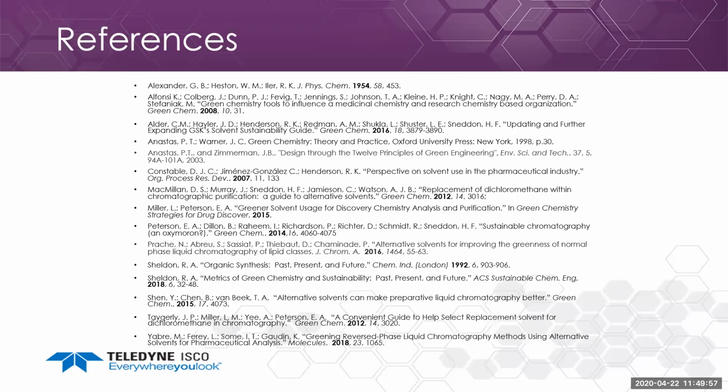We have a tech note regarding this. I can't remember the number off the top of my head, but if you go to our website and search for normal phase to reverse phase CombiFlash, it should come up. And if not, you can always email us with questions. That's something that a lot of people do try to do on their systems. Other times, if they're doing a lot of reverse phase separations, they'll dedicate a system to just reverse phase, so you don't have to go back and forth.